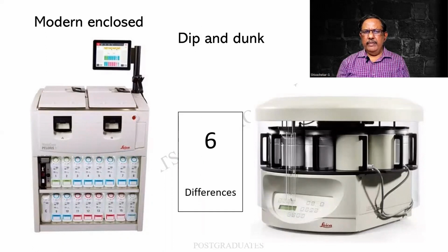The pivot and the lever, etc., are all not over there, and there is no master plate over here. Everything is being controlled by the computer. The tubes are invisible. And once the reagent is old, a red alert is given. It has to be changed.